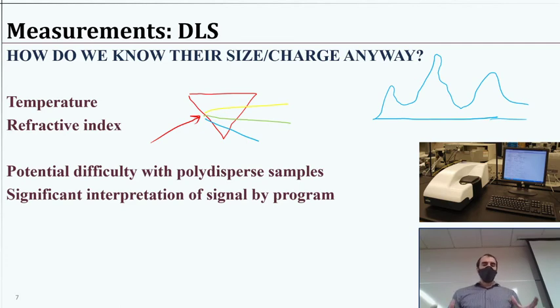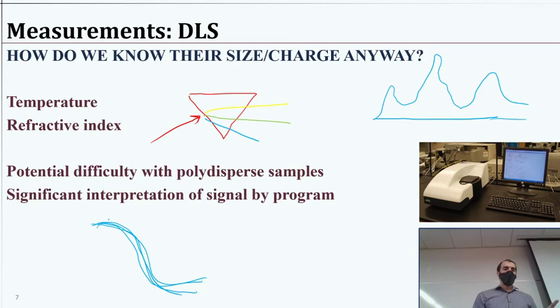Okay, and then given that whole correlation system, the last thing I want to say here is that with autocorrelation, we're taking very messy signals and then running these correlation programs and then averaging to see how the correlations fall off, and get some sort of average autocorrelation signal. Even with the repeated trials, we're going from this intensity signal that's interpreted based on this autocorrelation strategy, and then we're getting some intensity number that we relate to the size. So at this size, we expect that this many of them are at that size.